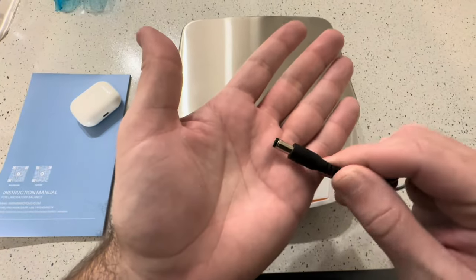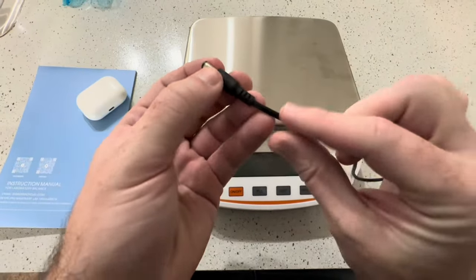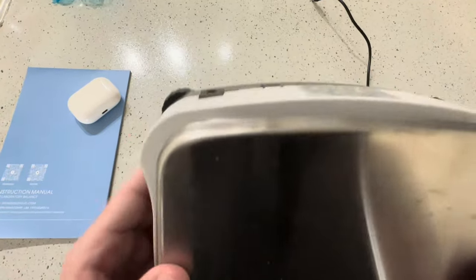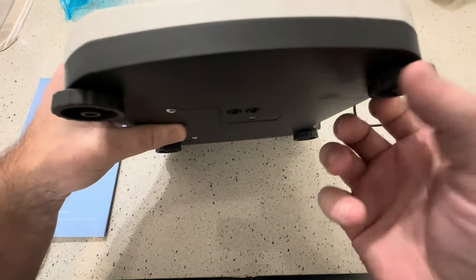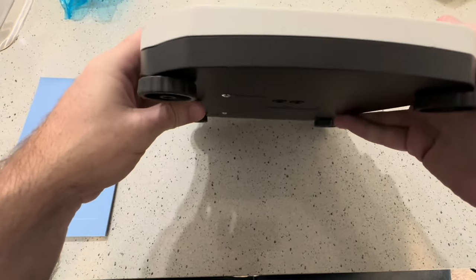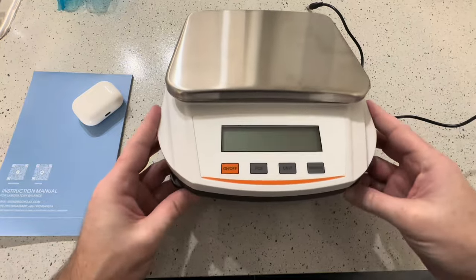I also like that we have a power cord that actually detaches, which means you can replace it in case it ever gets chewed up. Without that, you'd have to take the whole thing apart. You also want to make sure all the feet are even on a flat surface. This is a very simple, nice laboratory scale.